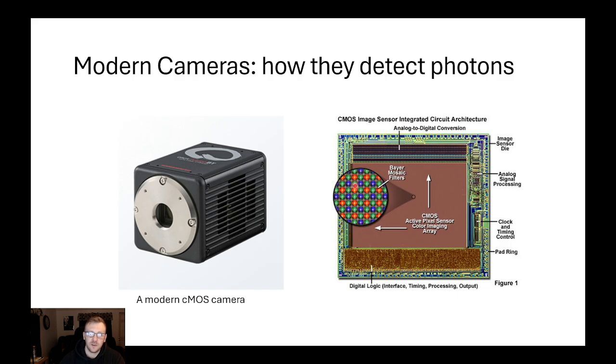So we're going to have a pixel size of 6.5 microns, and an image size of 2,400 pixels by 2,400 pixels. Those are not changeable on a camera-based system. Those are governed by chip architecture. There are other types of imaging, which I don't want to convolute things too much, that do not use a camera and a chip-based system, where you can modulate the size of the pixel. But for our purposes, we're talking about cameras, and our cameras determine our pixel size and our pixel distribution.